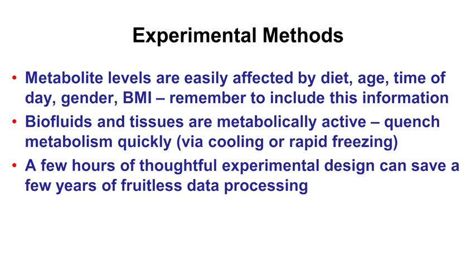It's also important to remember that if you are collecting samples that involve biofluids or tissues, they're metabolically active. Blood is a living sample. There are living cells in it. There are even living cells in urine and saliva. So while it's not generally important for someone doing DNA analysis, and it's not so important for someone doing proteomics, it's very important for someone doing metabolomics to quench the metabolism. That is, kill the cells or kill the proteins.